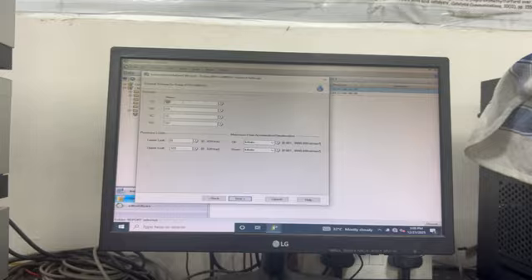For example, we are using only A, which is 0.05 molar H2SO4. The pressure limit we can set; the maximum is 620 bar, from 0 to there, set by default. When it reaches the upper limit, it will give us an alarm. Let's leave it as it is.